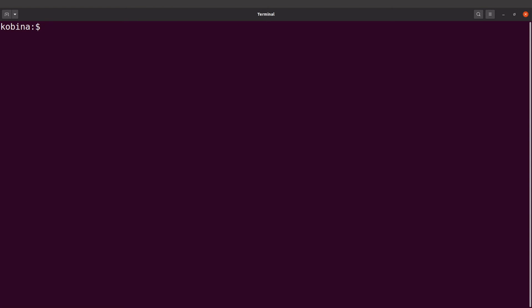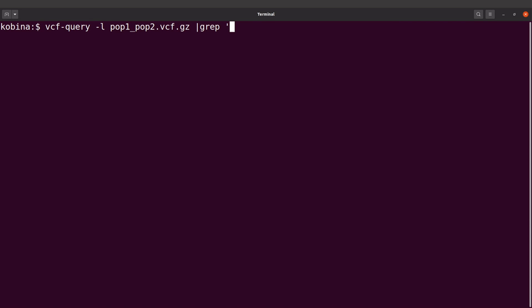Now let's do for pop two. So for pop two, that's population two, will be vcf-query dash l, I still get my VCF file, and then I'll say grep and this time I say PA, and now I'll just save it as pop two dot txt.